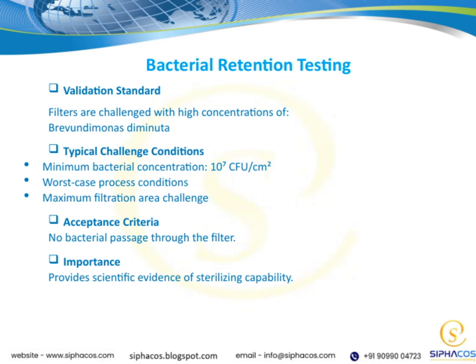The acceptance criteria are straightforward. No bacterial passage through the filter is allowed. This is a critical point because it provides scientific evidence of the sterilizing capability of the filter. In other words, if the filter passes this challenge, we can be confident that it effectively retains bacteria even under extreme conditions. This testing and validation process is essential for maintaining high standards of sterilization and ensuring product safety.